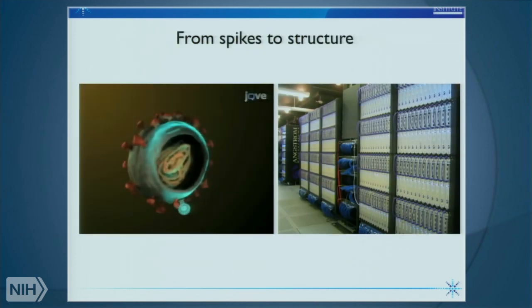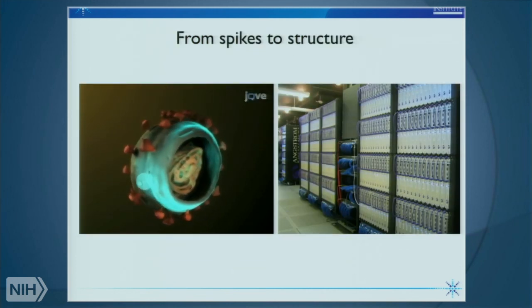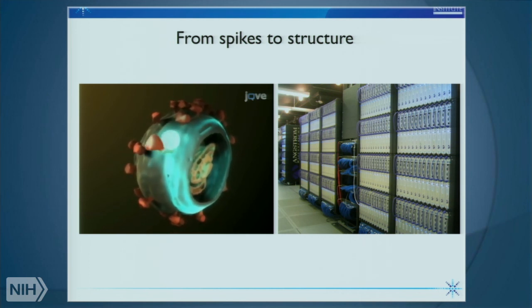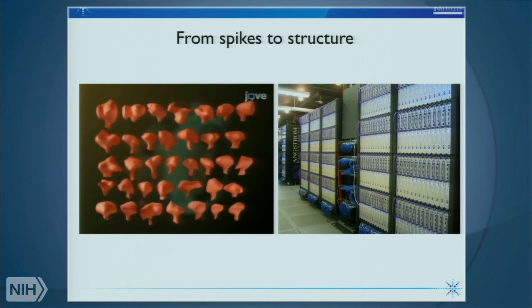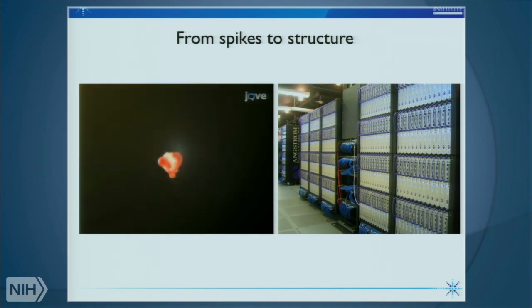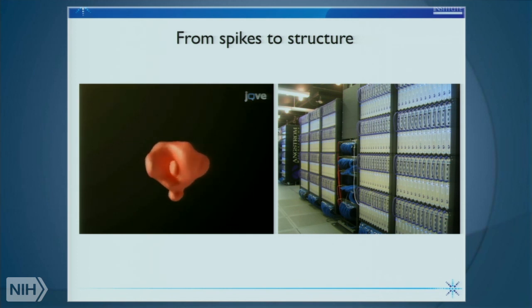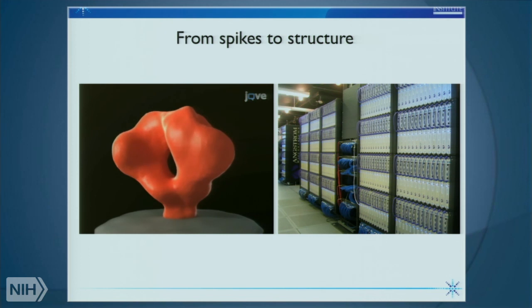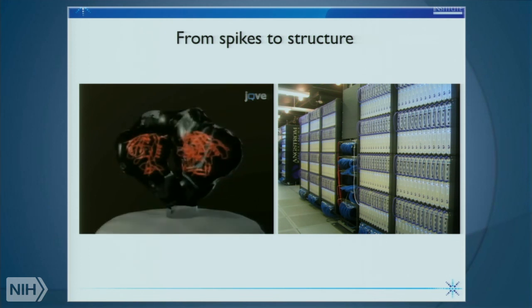And the strategy we developed, and this is work that Alberto Bartesaghi in the lab pioneered, was to take tomograms like this and then computationally extract the regions corresponding to these trimeric envelope glycoproteins, each one of which was at very low resolution. But by averaging them and aligning them and classifying them, we then derived the three-dimensional structure of the HIV envelope trimer. In 2008, this was the very first glimpse into what this molecular complex looked like on the surface of the virus.